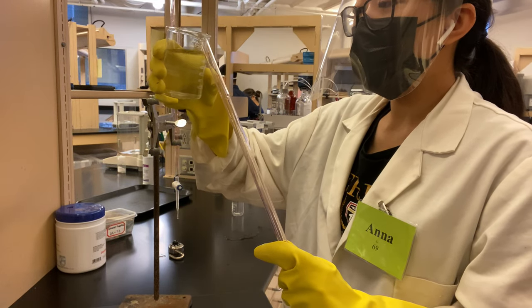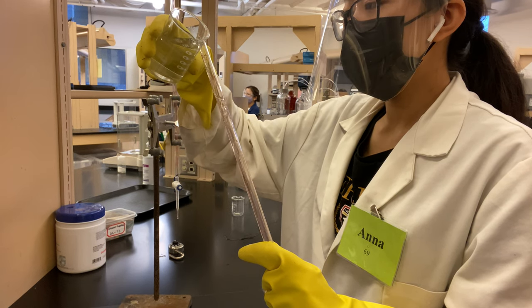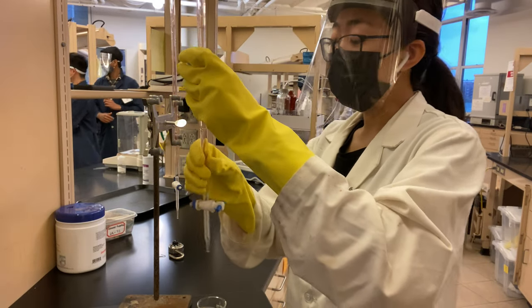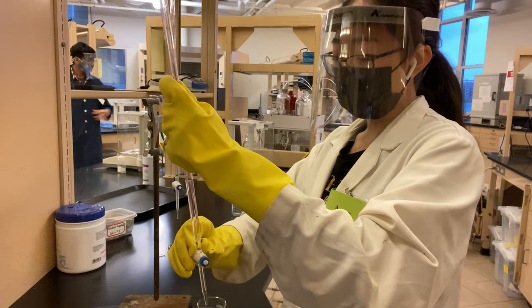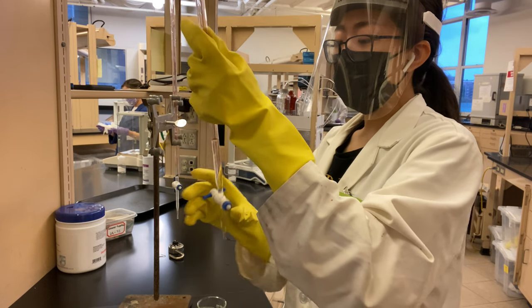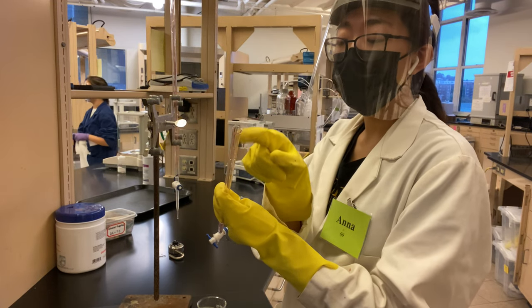So I'm just going to pour some water in. And then I'm going to dispense it through the tip to make sure that it's working well, and also turn it over a little bit. And then get any foam in there. And then I'm going to swirl it around the top to get any of the larger outer particles.